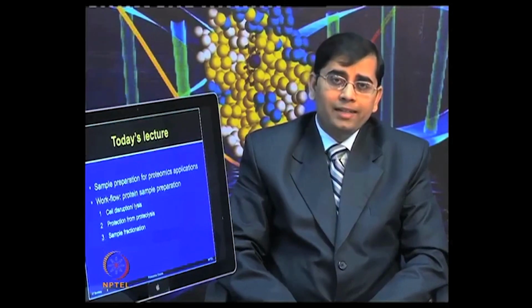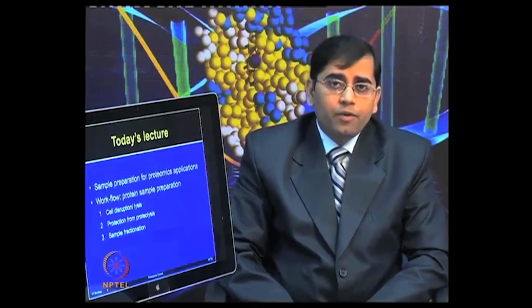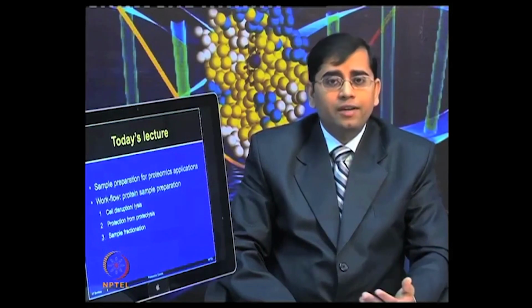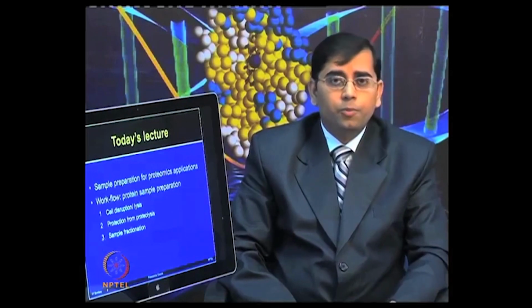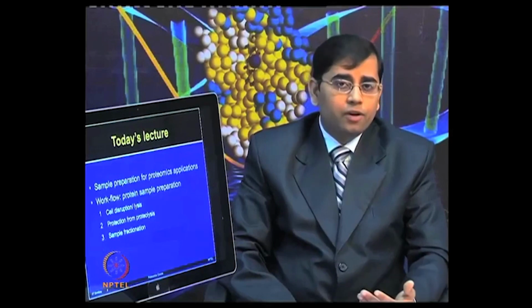But sample solubilization and some other components are added more when you are performing the gel based proteomics. So, during this lecture, I will talk to you about different components which are essential to make a good sample preparation for proteomic applications. I will give you a stepwise workflow.